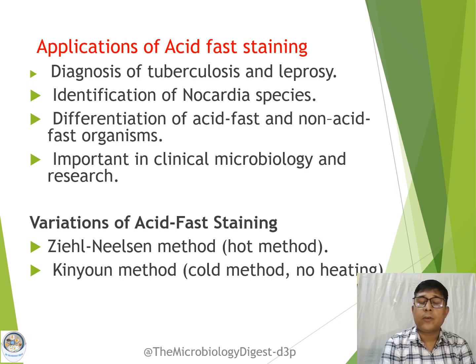So some variations have also been developed. First variation we have already discussed, that is the Ziehl-Neelsen method. This method is also otherwise called the hot method because we are applying heat as a mordant here. The second variation is called the Kinyoun method. It is also otherwise called the cold method because we are not applying any heat as a mordant here.